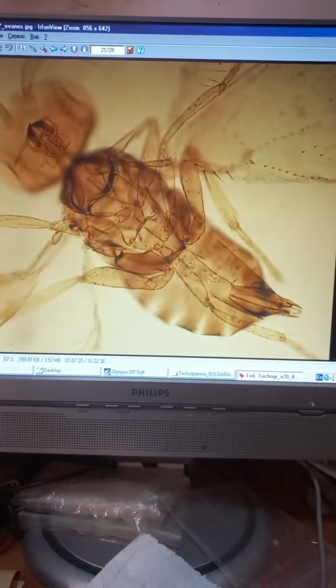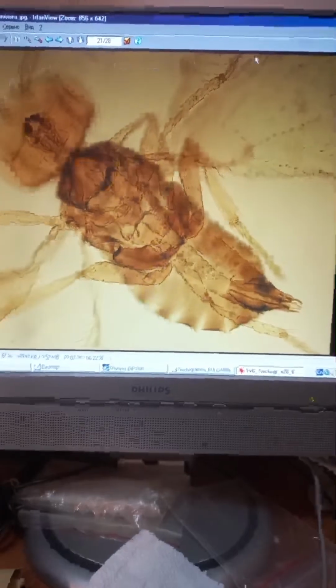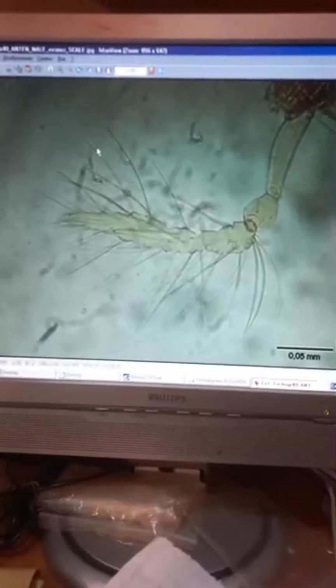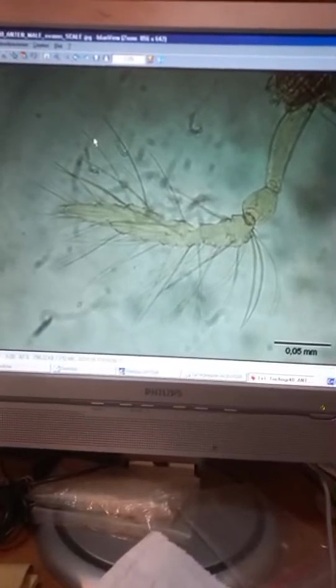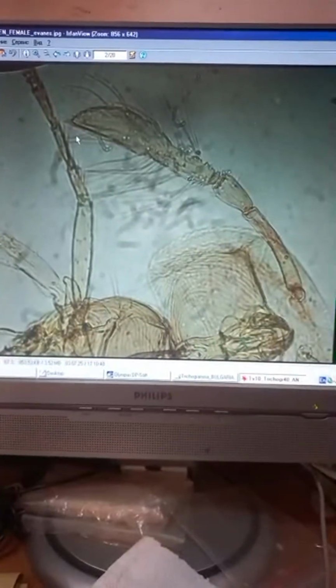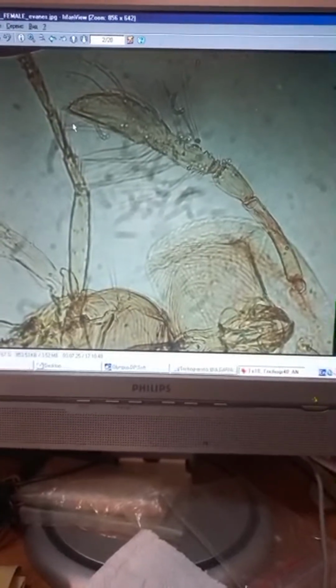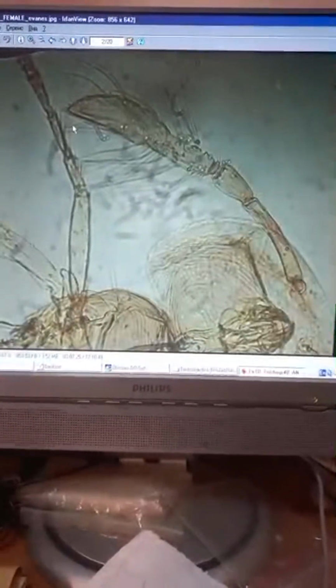Okay, here the male genitalia and body of Trichogramma evanescens, 200 magnification. Okay, here these are individuals with different antennae. This is antenna which is belonging to male. But what about second antenna? Second antenna is very reduced, like fused segments. Looks like fused segments of female. But first, male antenna. It also looks like male antenna.